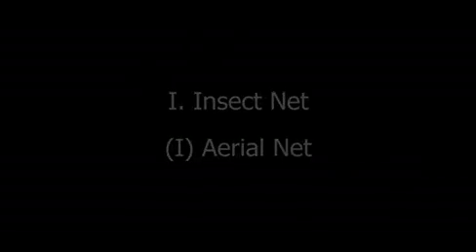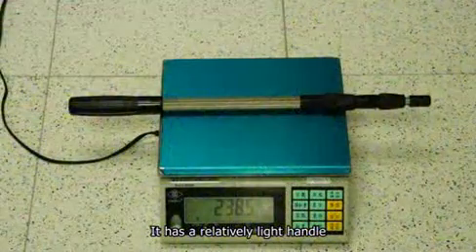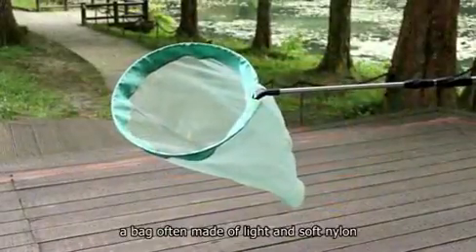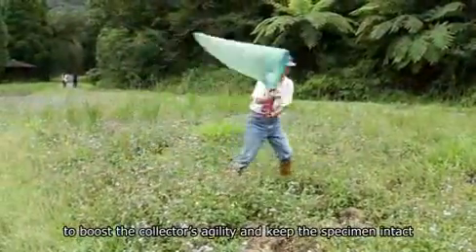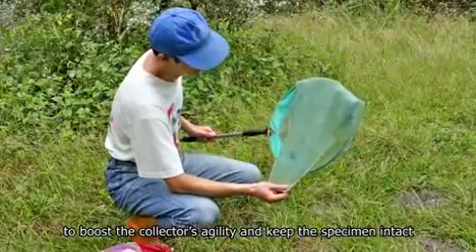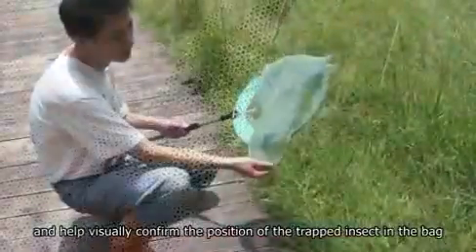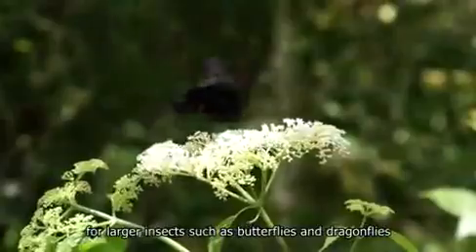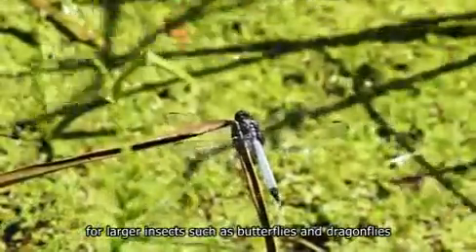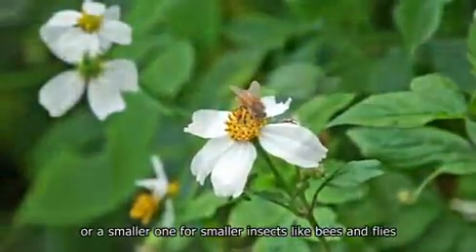Aerial net. An aerial net is used to collect flying or perched insects. It has a relatively light handle. A bag often made of light and soft nylon to boost the collector's agility and keep the specimen intact. A larger mesh size to reduce air resistance and help visually confirm the position of the trapped insect in the bag. And a stronger, larger rim for larger insects such as butterflies and dragonflies, or a smaller one for smaller insects like bees and flies.